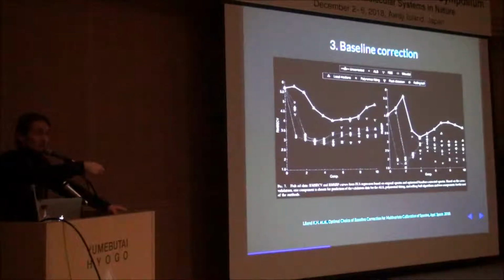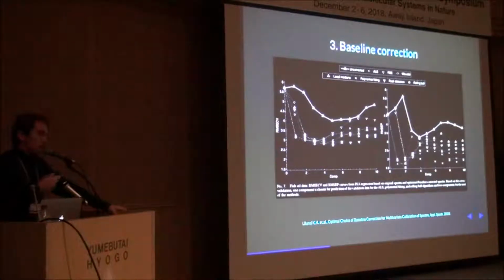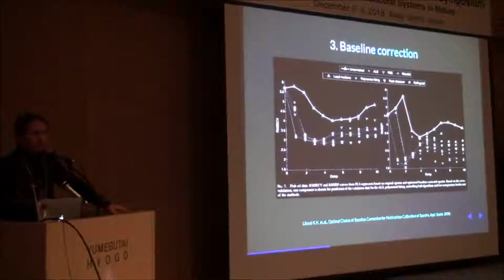So we're just going through this very quickly. The point is that around principal component 3, you get the lowest error, and if you can see here, all these circles and triangles are pretty much lumped up around the same value, so there is not a very big difference between the methods. But the point is that pre-processing does create a significant difference, so you should use it, but which one, you take your pick.